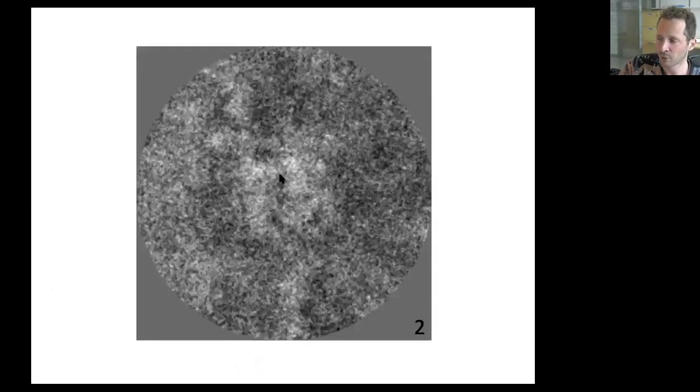But because with protein molecules in solution you have many copies of what you hope is all the same molecule, and if you can determine images which are in the same view, because the molecules were tumbling around in random orientations, hopefully, so you'd have top views and side views and front views and all kinds of intermediate views in those images, provided you can determine which ones are top views and which ones are side views. And so you can align these, because you have to rotationally and translationally put them on top of each other. Then you can start doing averaging.